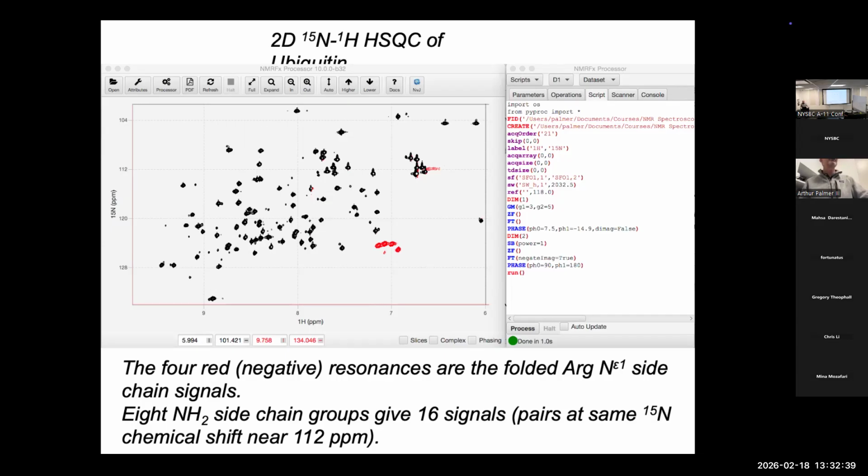So for proteins, so-called ILV labeling is a way of labeling isoleucine, leucine, valine with specific labeling patterns for the methyls because you can buy the precursors that have that labeling. But sometimes we still grow on fractional D2O. That has the advantage that you can get essentially 100%, whereas if you grow on, say, 50% D2O, 50% H2O, you're going to get a statistical distribution of the different isotopomers, and none of them will be fully populated. But we still do it both ways sometimes.